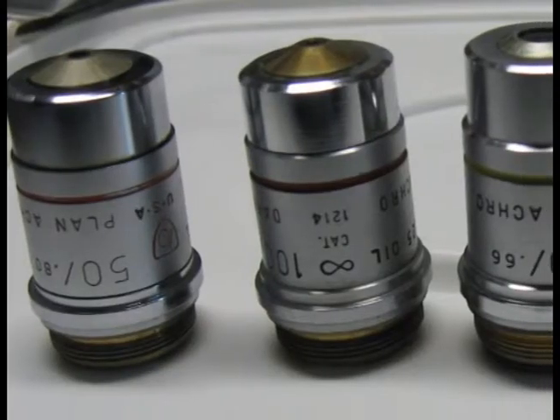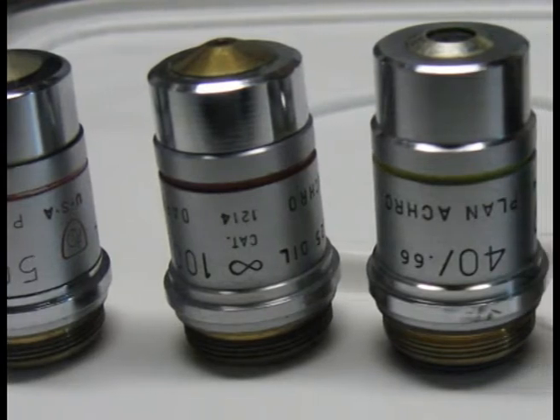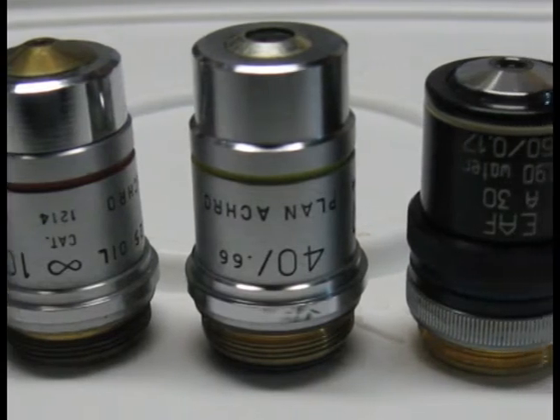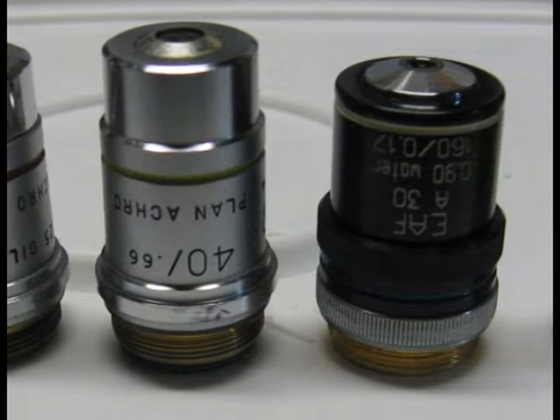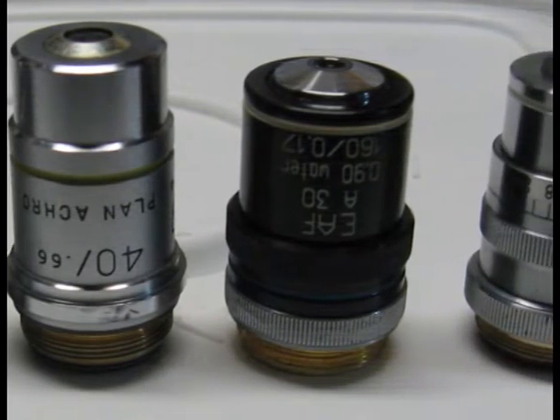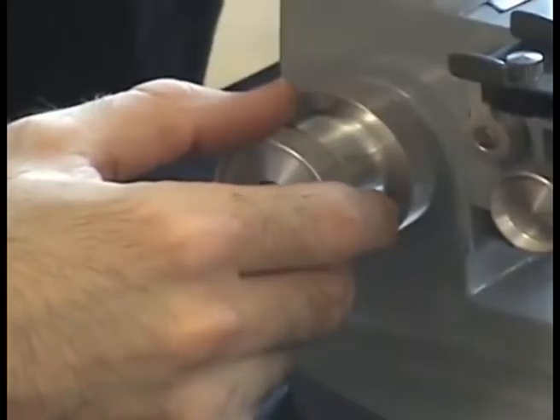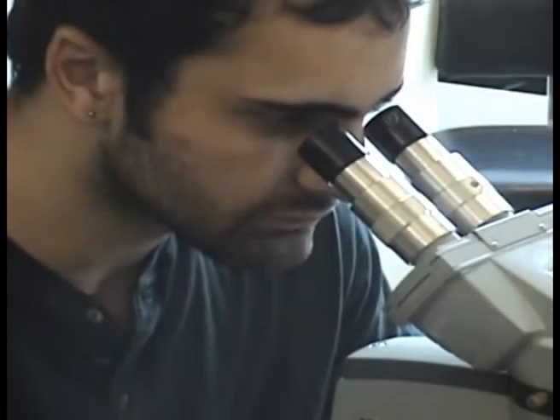Magnification is the first principal function of the objective. The magnifying power of an objective is called its initial magnification. The magnification is usually marked on the metal surface and ranges from 1x to 100x. Objectives may be classified according to their magnification into low, medium and high power. Low power objective is used for observing large scale features such as rock texture, and medium power objective is used for general observation, while high power objective is used for observing small scale features and interference figures.